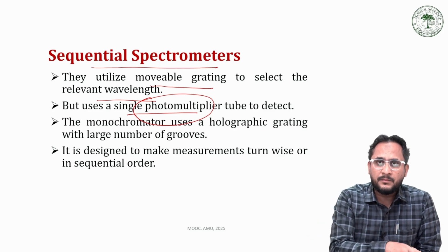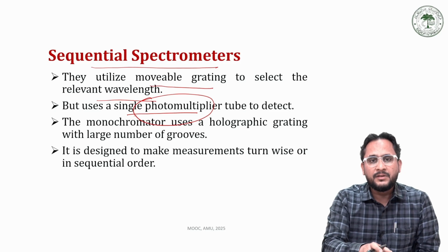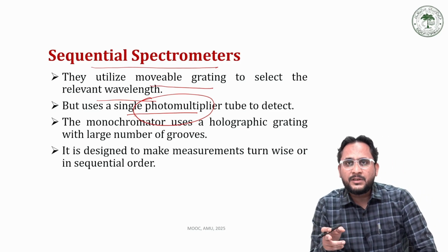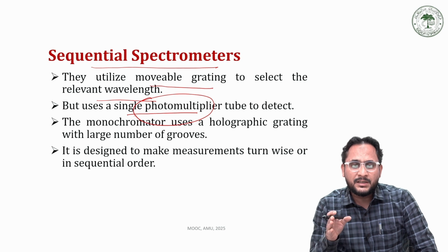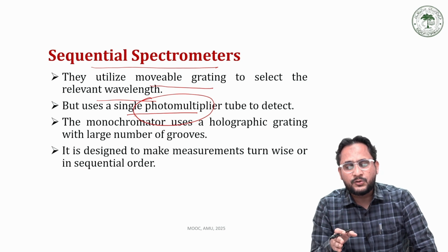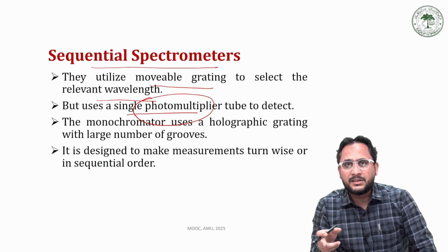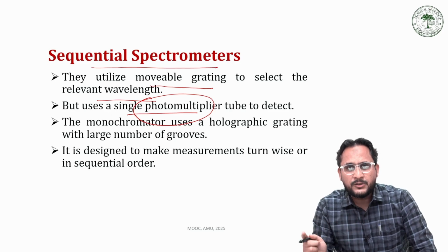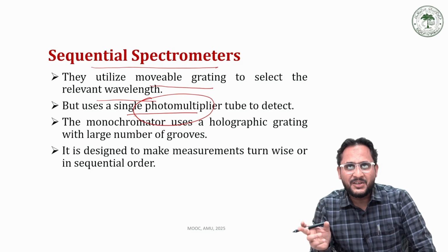For the second element, we again put in the sample, which is drawn with the help of a peristaltic pump into the nebulizer, and it again gets converted into aerosol, which is then injected into the spray chamber and finally reaches the excitation source. Upon excitation it emits light, and the emitted radiation again passes through the monochromator. We allow a specific wavelength to pass through, which falls on the detector so that the second element can be detected. In this way we do the analysis.